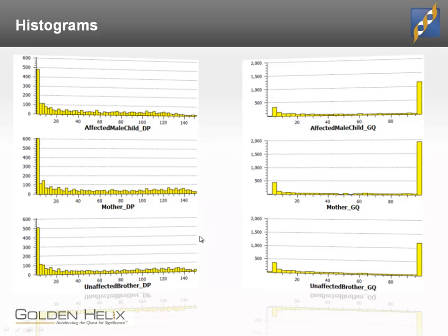And in fact, if you wanted to do it yourself, interactively run through it, Gholson has set up or approved a system in which you can request access to this data. It's still clinical data under a research setting, so it needs to be gated, but you can request access, and Gholson will be able to approve you if you would like to try to collaborate with him to validate these findings. So as I mentioned, we were able to get to these histograms.